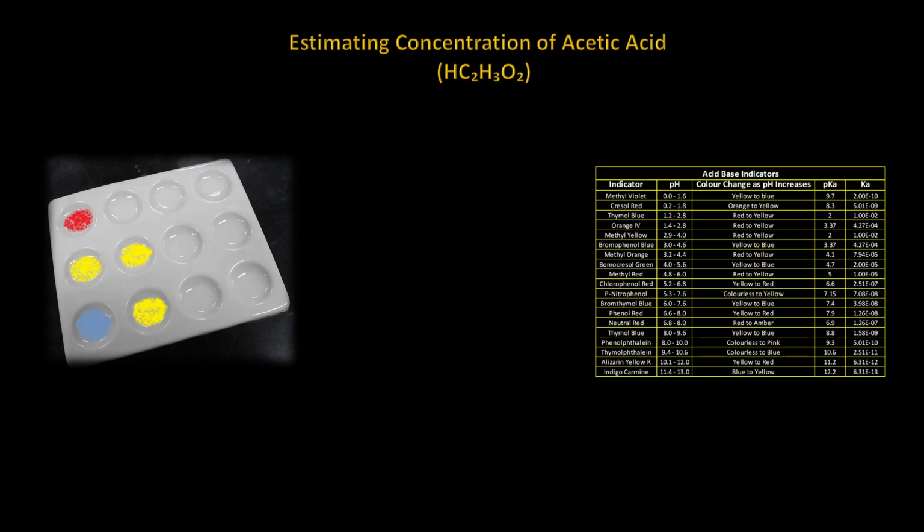As shown, neutral red, having a color that changes between pH range of 6.8 and 8.0, remained red when a few drops were added to the first well, top left in the plate. This shows that the pH value of the acid is below pH 6.8. Chlorophenol red was added to the second well. Again, no color change. Chlorophenol red changes pH between 5.2 and 6.8. Still no color change from yellow to red, indicating that the pH value is below 5.2.